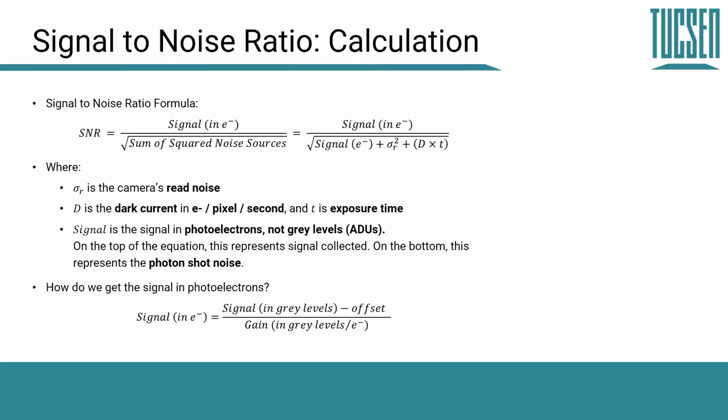We can also see the different effects of, for example, changing pixel size, which will change the amount of signal that we can collect. In general, what we can do with this formula is just compare the results and compare the sensitivities of different cameras and different circumstances when getting an objective number out, which will tell us how good our image quality is going to be. This is a very powerful formula once we get accustomed to using it.